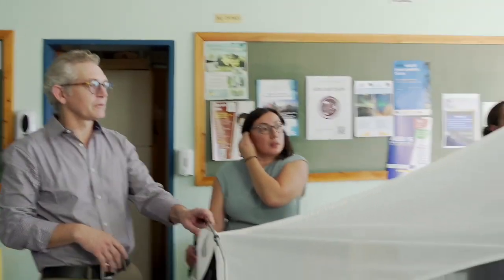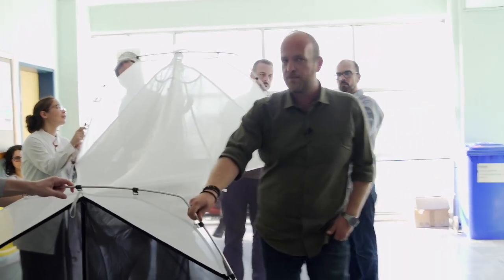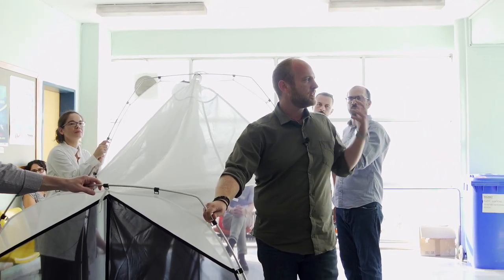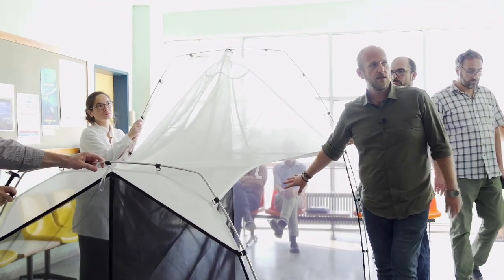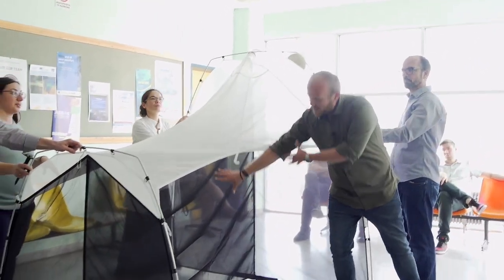So this is the trap. We are very careful when we place the trap in the field to understand the direction of the wind. We want all this side to face the wind, to come directly here.